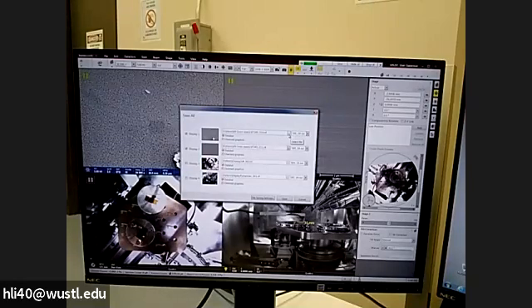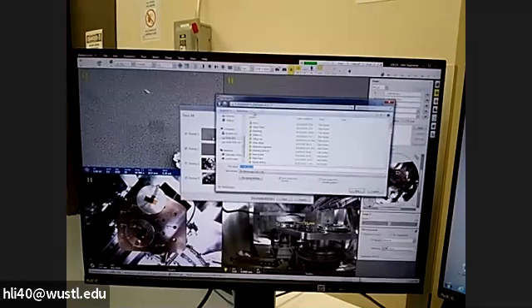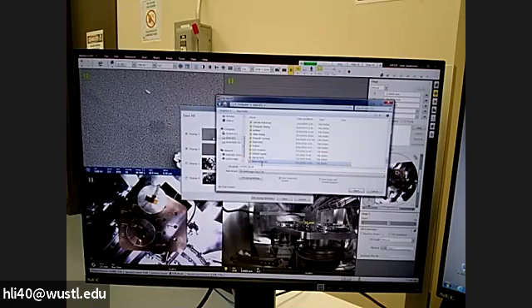It's a recent update. So you need to set up the file name. Select this dot, click go to Data, and put your name. Select New Folder, put your name there. This is training, so I put training. Okay. And then you highlight it. Oh, we have a training here. Okay, we just use a new folder too. Okay, then we open it.